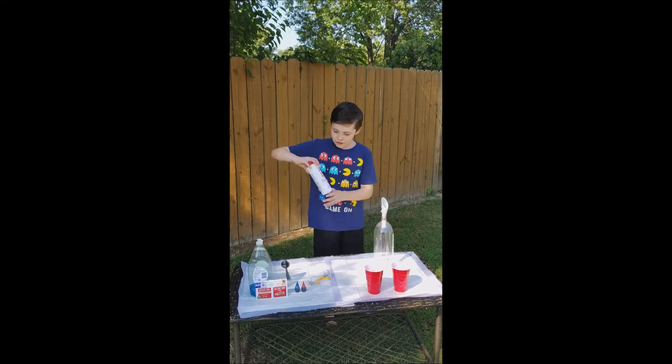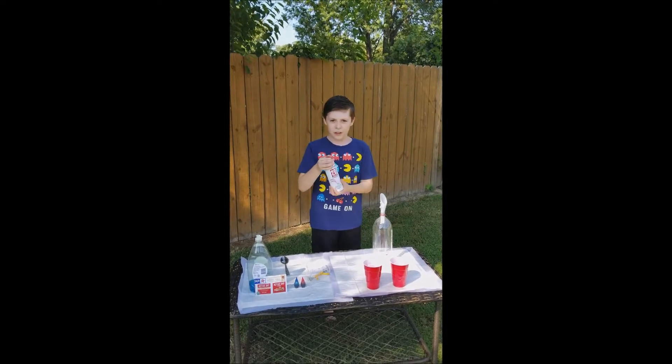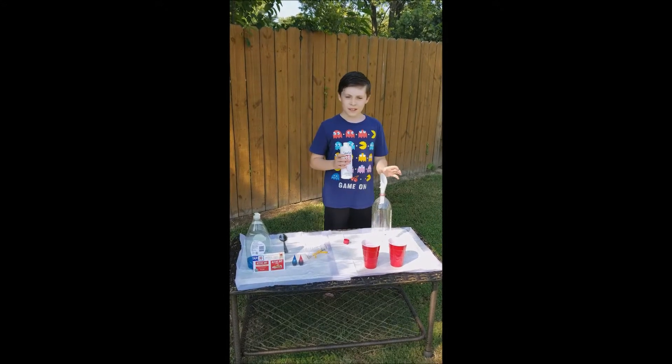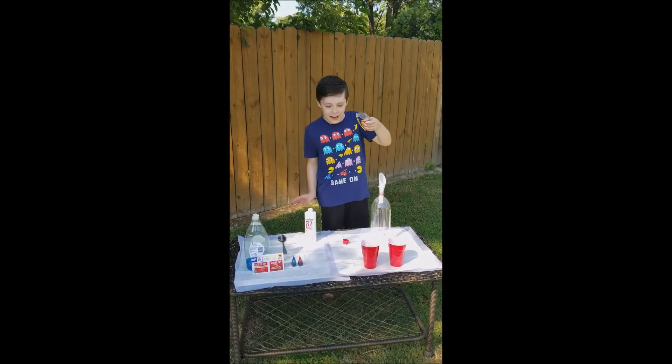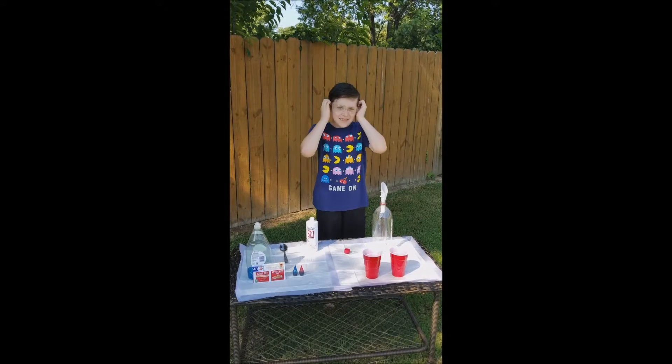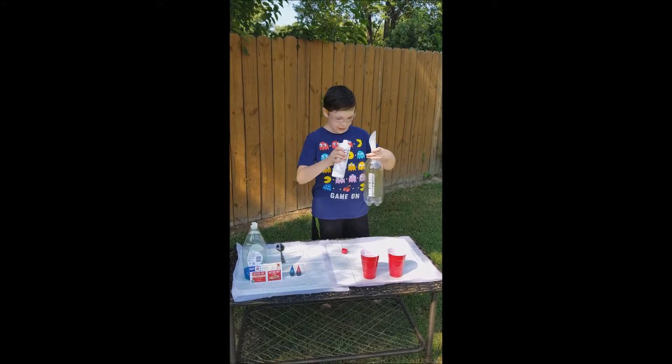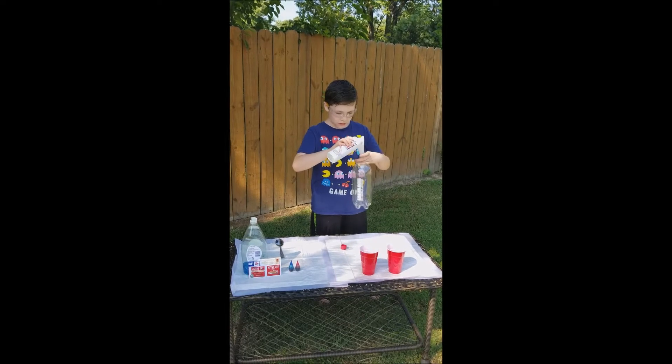First thing is you can get at least 6% hydrogen peroxide. And I almost forgot — safety first! I cannot see a thing out of these, but I will. All right, so I have a little container of mine.